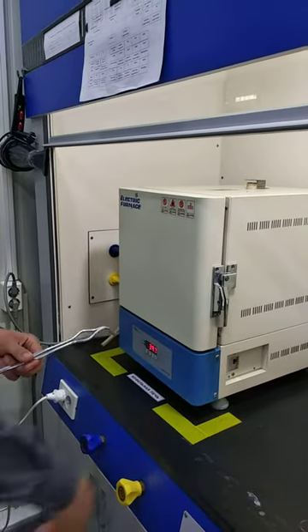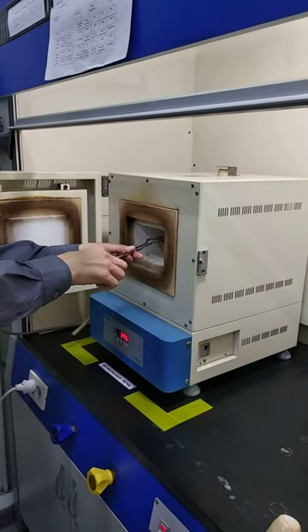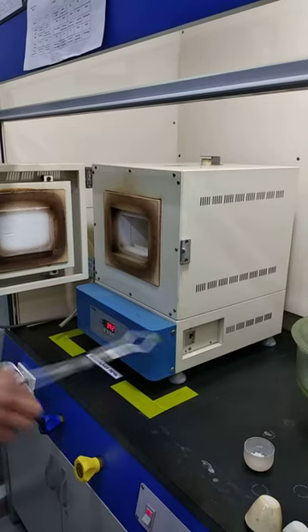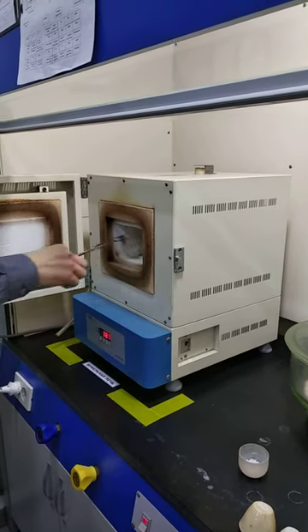Now it's time to take away our samples. We just held them for 30 minutes, and now we will reduce the temperature of the crucibles down to about room temperature.